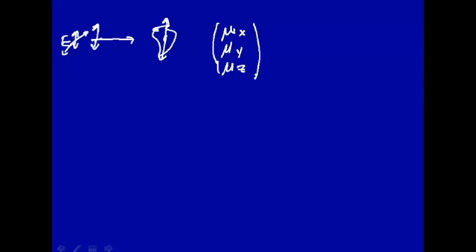So that's what's induced, and you have coming into that an electric field in the x direction, electric field in the y direction, electric field in the z direction. Well, note that for plane polarized light, you have x and y, but you don't have z.